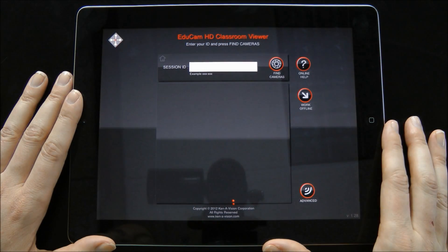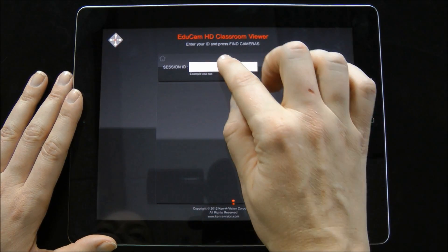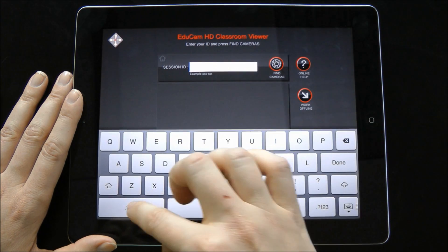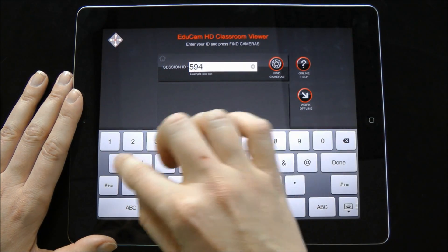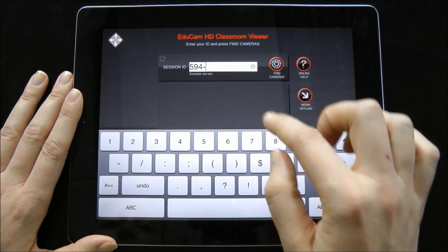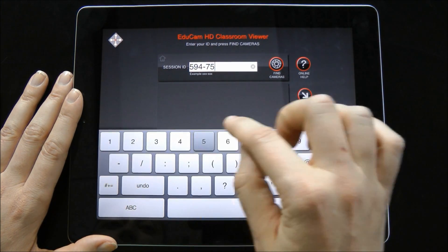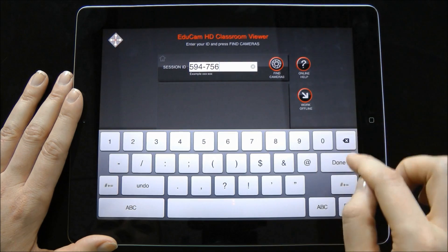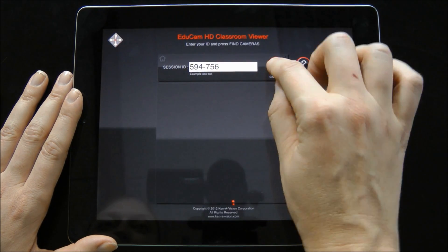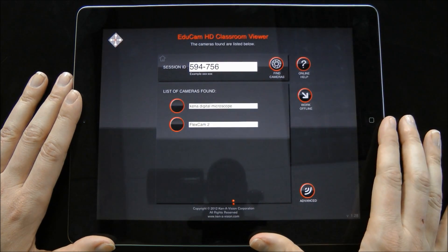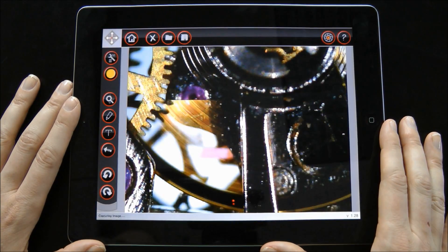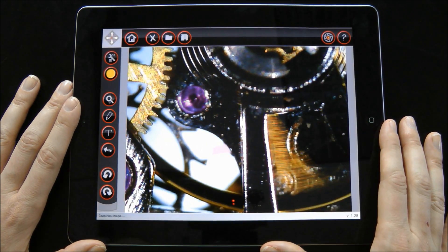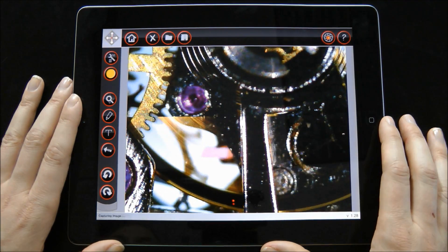After launching EduCam, enter your unique session ID generated by the Applied Vision image server. Select a camera, and now you're viewing a live image.